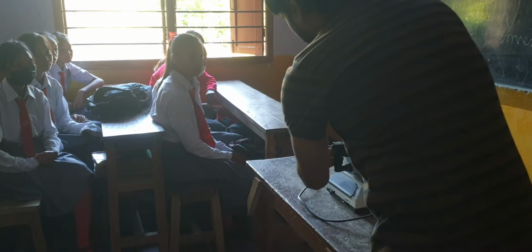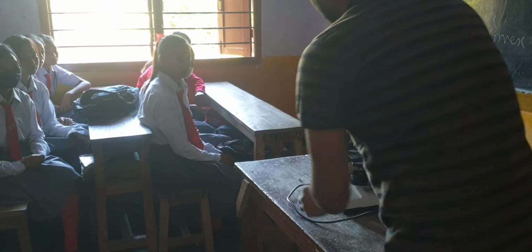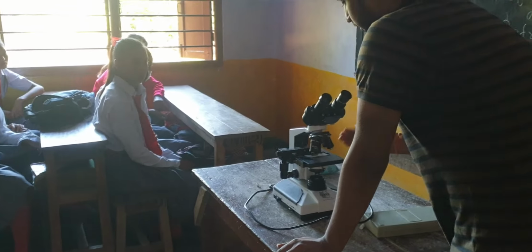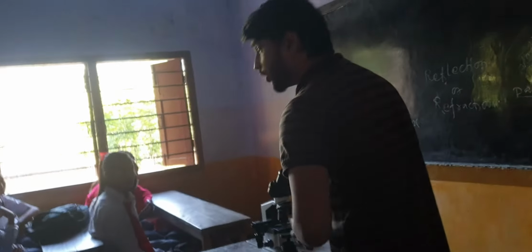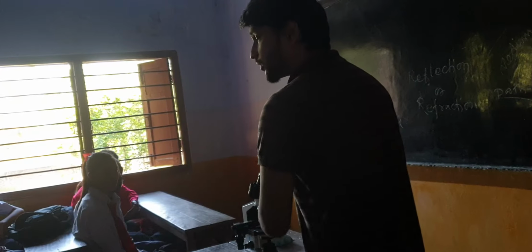Now we have two types of dials here. They are called adjustment dials. This is to focus your slide. Like, have you used a camera? Any sort of camera. For capturing a clear image, we have to focus, right? Without focus, it will look blurred. In the same way, in a microscope, we need to focus our slide, or our sample which is present on the slide.